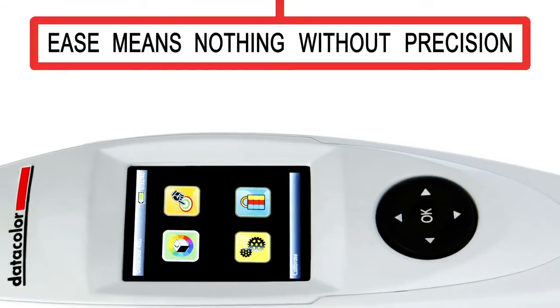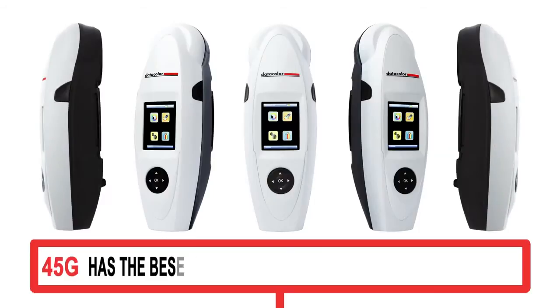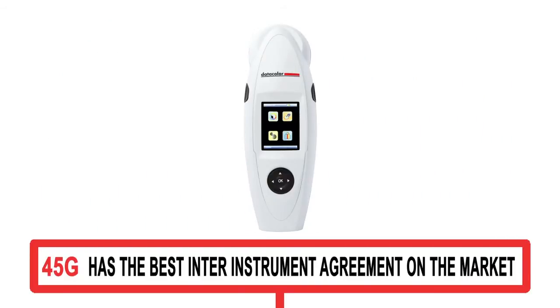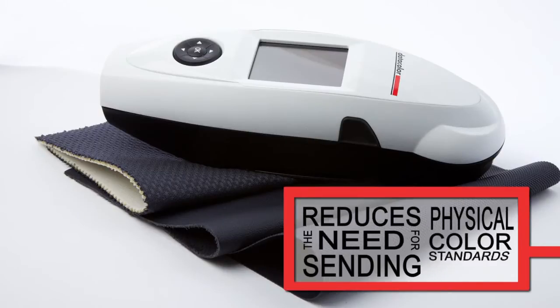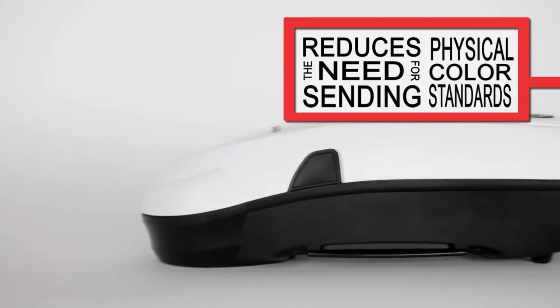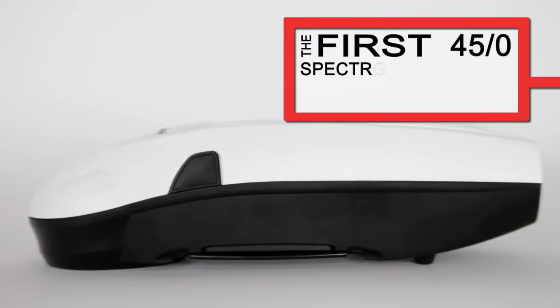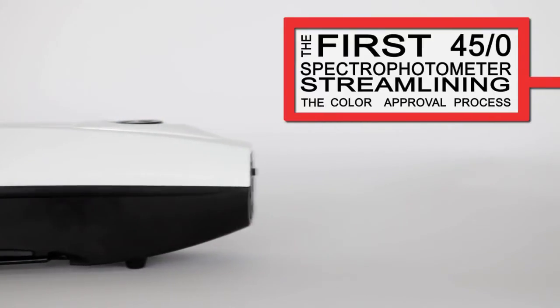Ease means nothing without precision, and as you would expect from Datacolor, the 45G has the best inter-instrument agreement on the market with class-leading repeatability. This greatly reduces the need for sending physical colour standards. This means that the 45G has the precision to be the first 45-zero spectrophotometer to allow digital colour communication, thereby streamlining the colour approval process.